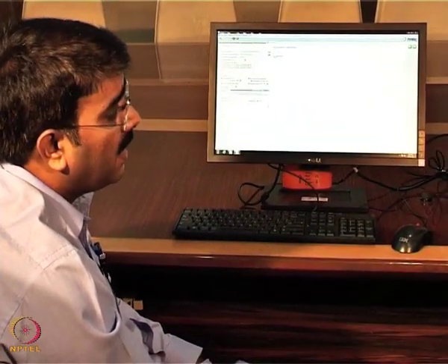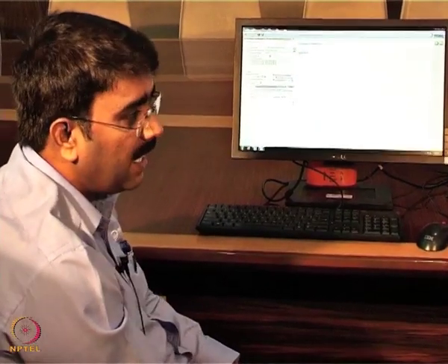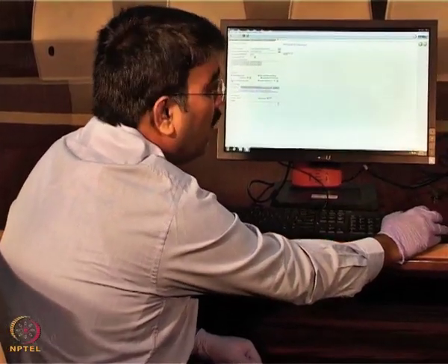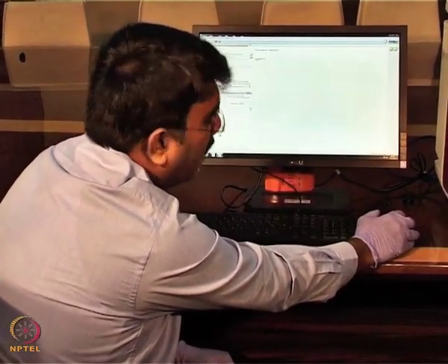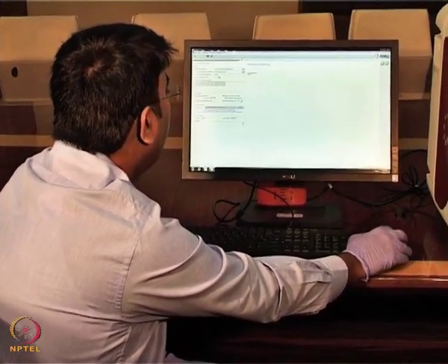In some cases it's required, some cases not. You know that shaking sometimes enhances the aggregation, so we can uncheck this. And also, I think prior to the experiment we already started a hydration of the sensors. Now the sensors got hydrated, we can directly uncheck this, and we can go for the experiment.